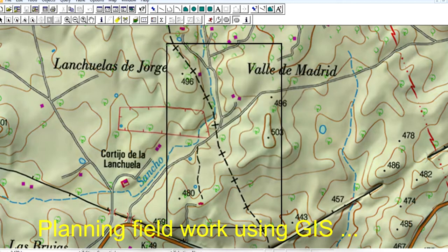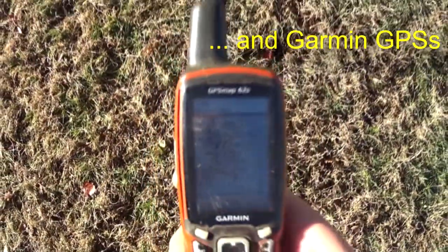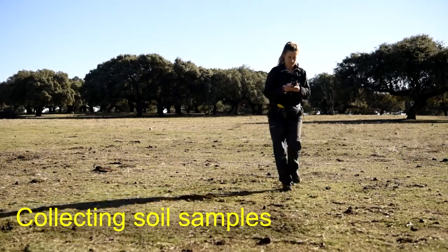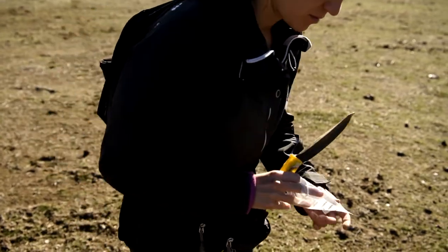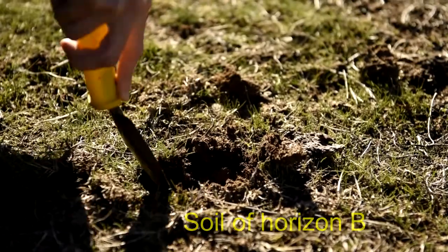Multi-element fine fraction analysis, or MEFA, is a cost-effective methodology for soil and stream sediment sampling. First of all, we reduce the size of samples to 30 to 50 grams and increase the number of samples.